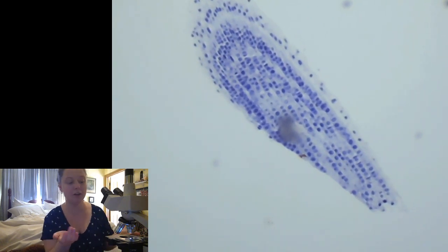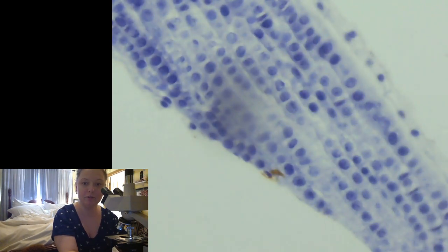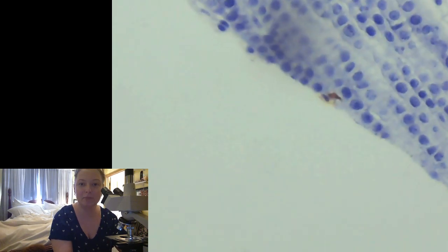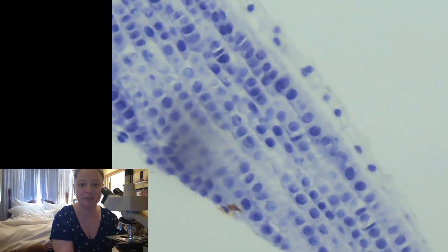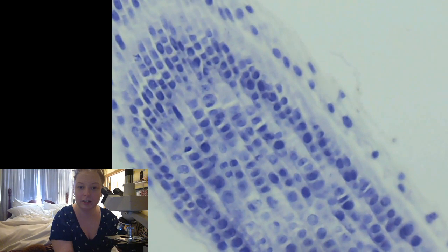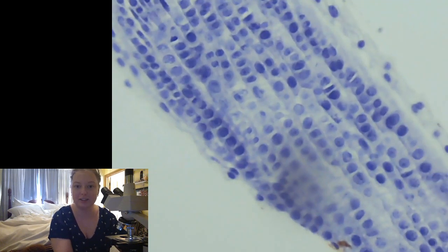And then if we want to go a little deeper, we'll move it over to our next slide, and that's going to make it fuzzy again. So we have to bring it back into view. We can see, so these cells are going to all be in different stages of mitosis. So this is an onion root tip cell, and the tip of an onion root is growing.